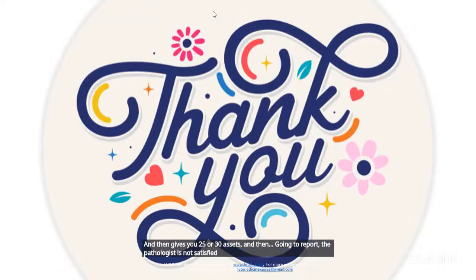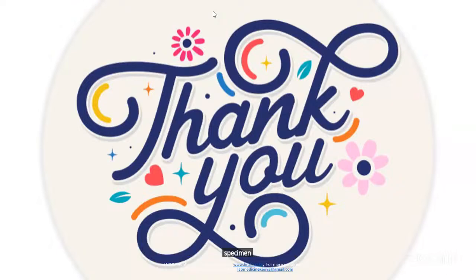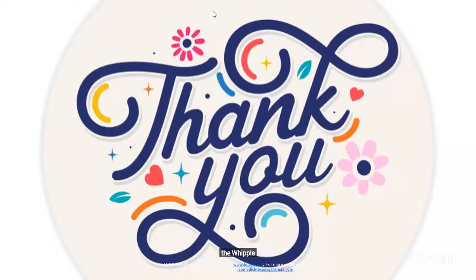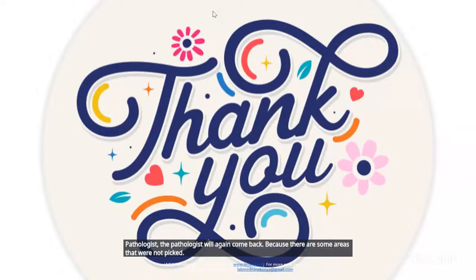There's also the Whipple surgery, for the pancreas and the duodenum. We find that most registrars are not able to handle it. And those that handle it, when they go back for reporting, the pathologist will come back again because there are some areas that were not picked, for recuts.